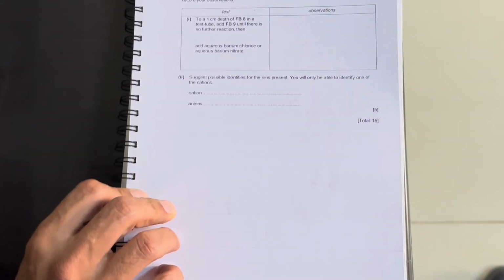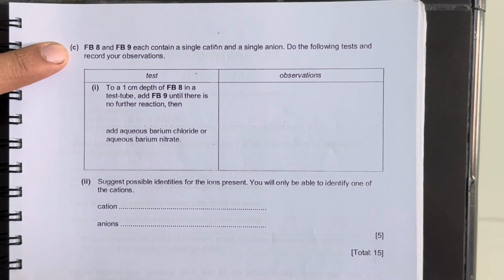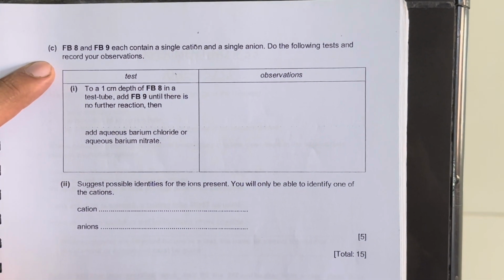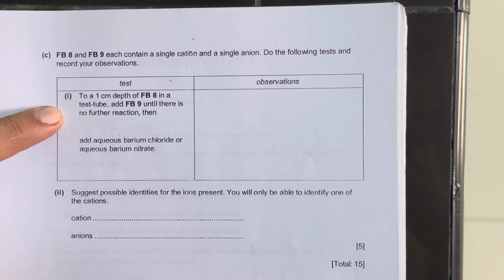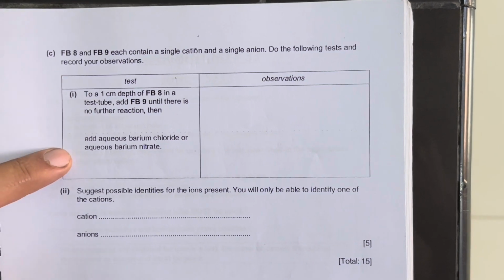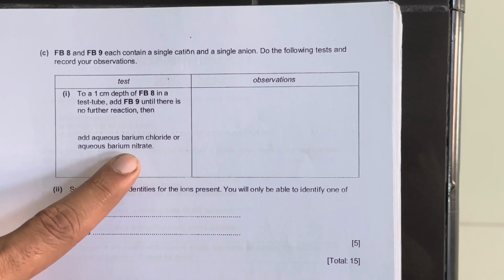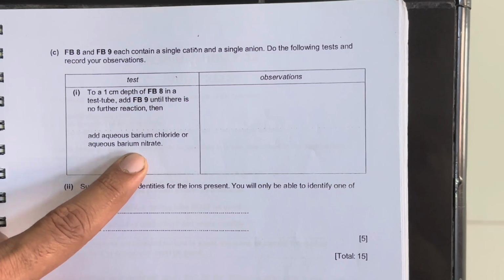Now let's move on to the next part in the question, which says FB8 and FB9 each contain a single cation and a single anion. Do the following test and record your observations. The first test is, to a 1 centimeter depth of FB8 in a test tube, add FB9 until there is no further reaction. Then there is a dotted line, meaning in the same test tube we have to add aqueous barium chloride or barium nitrate. Obviously this barium chloride or nitrate is added to see the presence of sulfate or sulfite. So let's perform this test now.